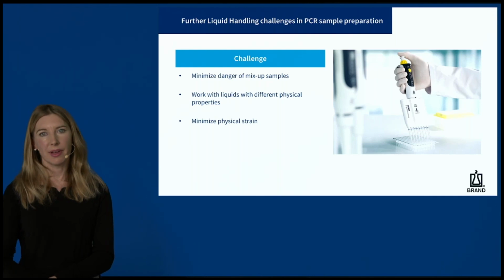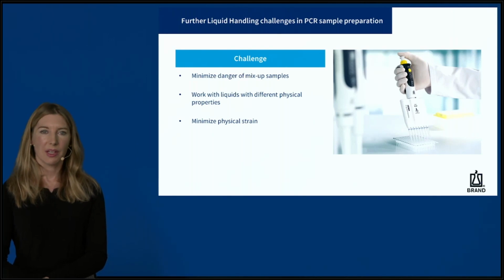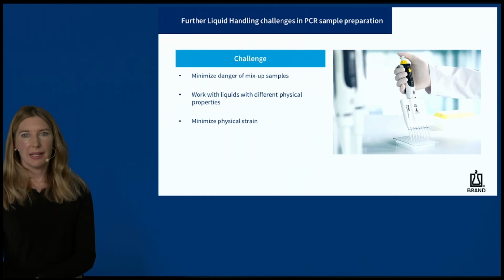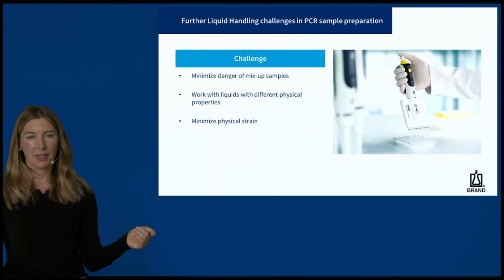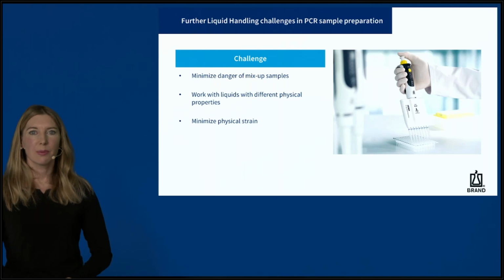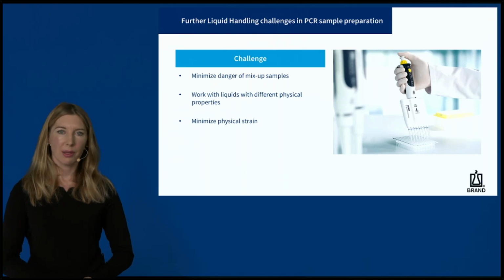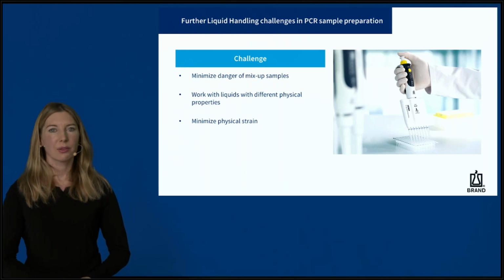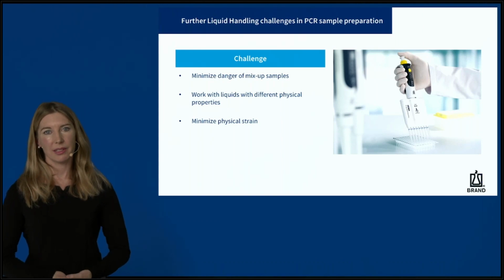There are different devices which might help to prevent mix-up of samples and which make work more efficient, as for example multi-channel pipettes. Liquids from plates are transferred like in the picture on the right hand. A further challenge is the mix of liquids with different physical properties. On the one hand, aqueous solutions are pipetted, but also Taq polymerase, which is more viscous, has to be added without pipetting errors.